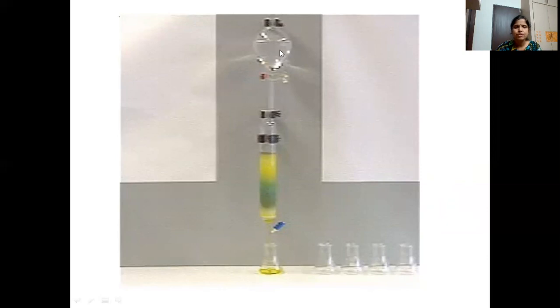You can do it manually, or with the help of this stopcock you can set how the flow of the mobile phase should be, that is, how many drops should fall into the column. All that you can set here itself, or else you can do it manually by taking mobile phase in a beaker and adding it from the top. So this is the setup for column chromatography. Keep on collecting the various fractions in the conical flask, and then we have to run the TLC.